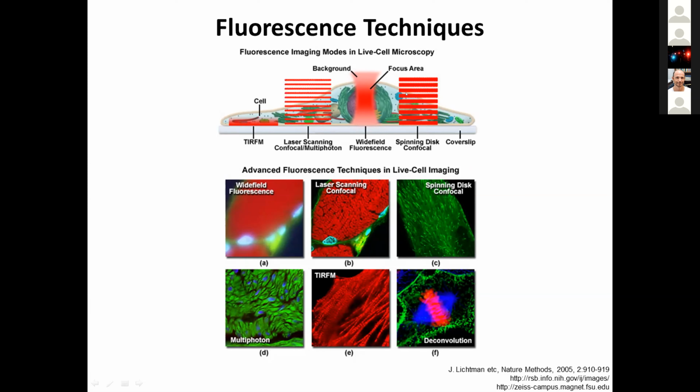This is also done by another technique, which is called spinning disk, which is a similar approach to the laser scanning confocal microscope, but with lower resolution. But as usual, the limitation on one side is an advantage on another. For example, in this case, you can go really fast scanning multi-point and basically have a speed at the rate of the camera. The other possibility is, for example, TIRF, which is an effect where you can excite fluorophores near the surface, and this is very useful when you are studying things in the membrane.